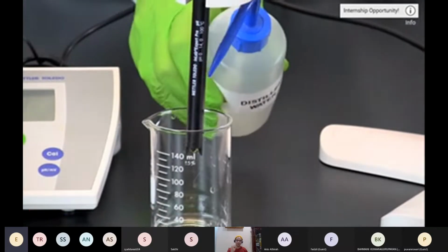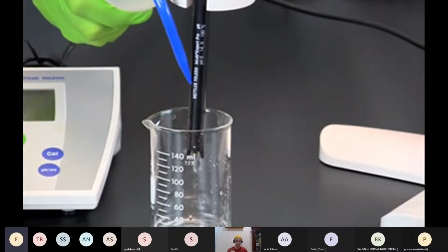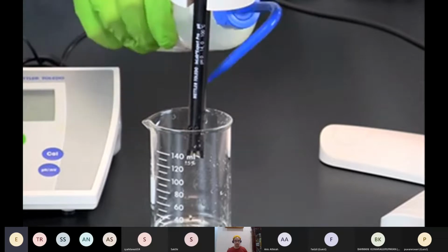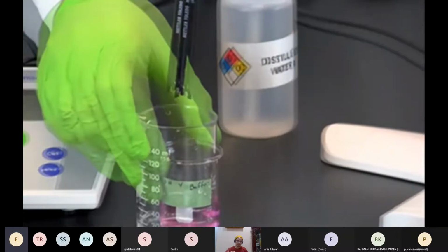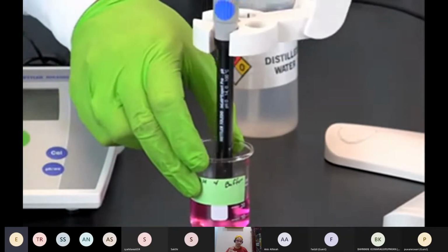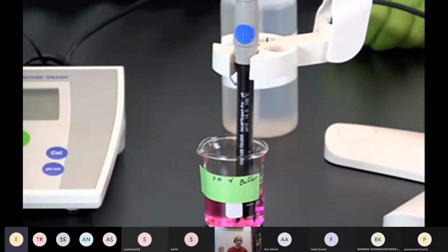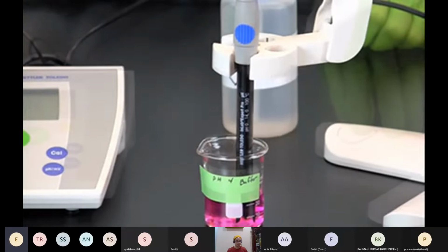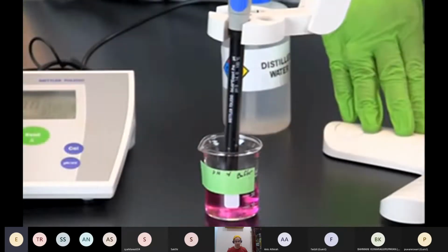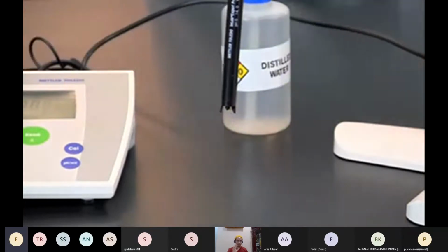So as you can see, the process of calibration is only taking the reading of those buffer solution, standard solution. Maksudnya kamu ambil pH 7 punya buffer solution, tuang dalam beaker and then ambil bacaan pH tu. So kalau bacaan pH tu sama seperti yang tertulis dalam label, so that means your calibration is going okay lah.